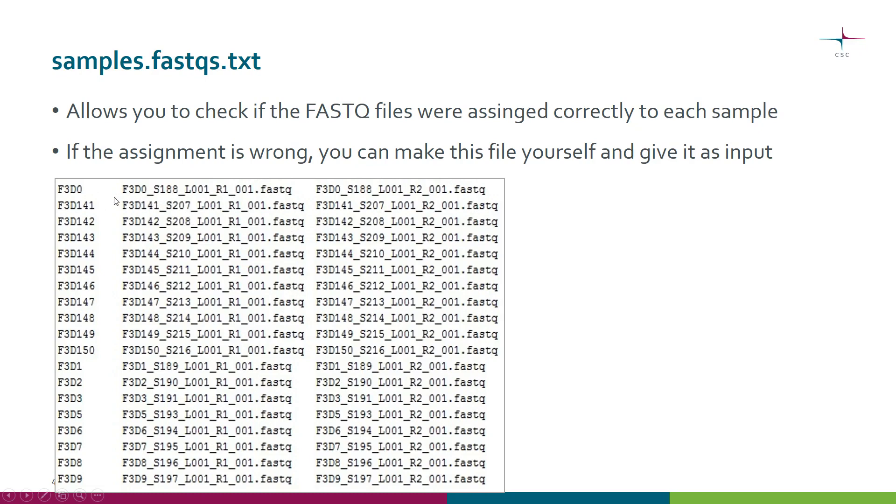Here I have a sample name and then the two files that were assigned to these samples. I can see that yes, this was the pair of FASTQ files so the pairing was correct.